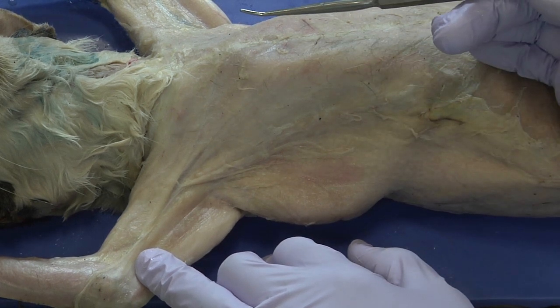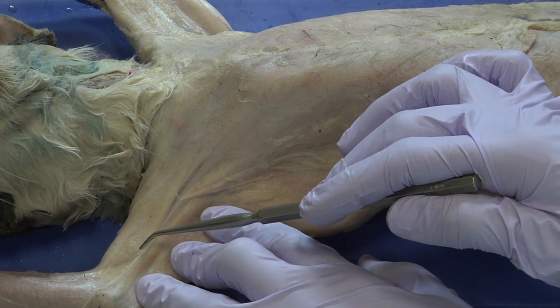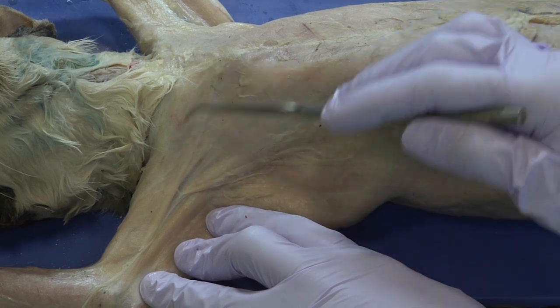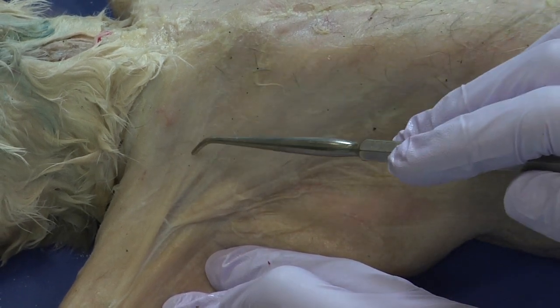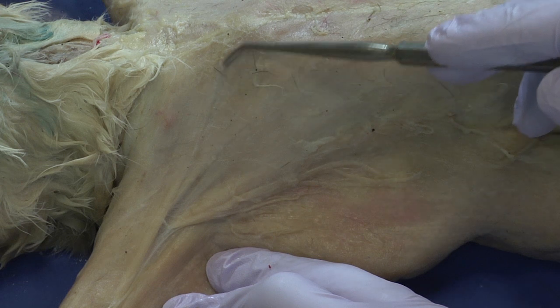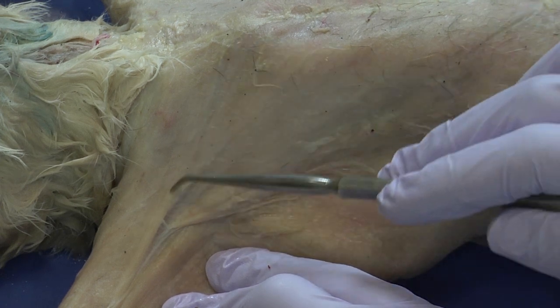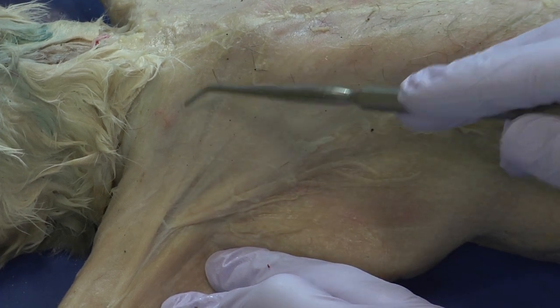Muscles have a point of origin and a point of insertion — those are the attachment points for the muscle. If you look closely and follow the direction of the muscle fibers, you can see that some fibers run horizontally, while moving down, the striping is arranged in a different orientation, traveling more along an angle. At the line where that transition occurs from horizontal to diagonal, that's where the separation between one muscle and another is.